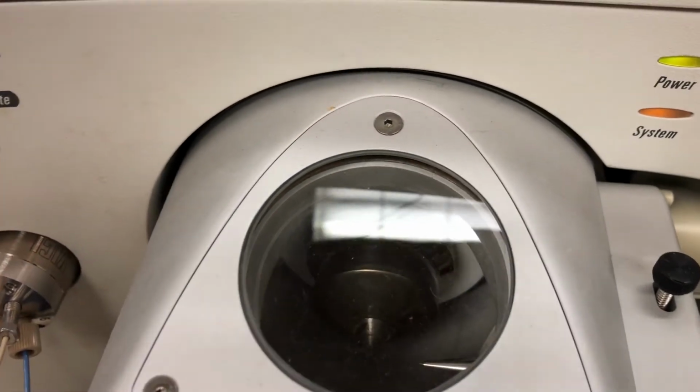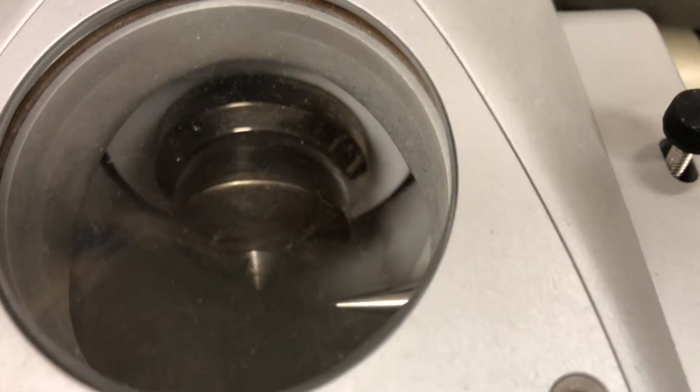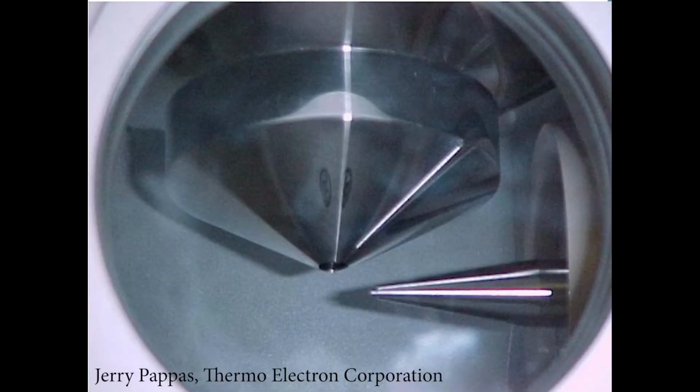And we look down on top of this, and the angle's a little bit different, but we have that needle. That's the electrospray needle coming in. And then that tip at the very front of the instrument is the inlet that samples the ions. Let's take a closer look at this one. So there is the electrospray needle tip, and it is orthogonal. It's at a right angle to the inlet of the mass spectrometer.